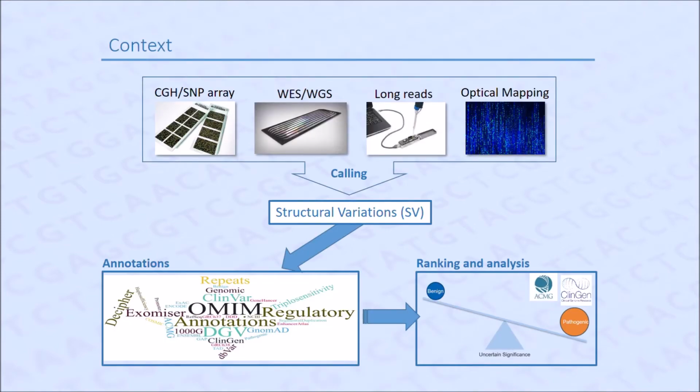First, I would like to explain the context of structural variations, that I'm going to call SV, in human genetics. SV are generally defined as variation in a DNA region that vary in length from 50 base pairs to many megabases, and SV includes several classes such as duplications and deletion, and also translocation, inversions, breakpoints, and so on.